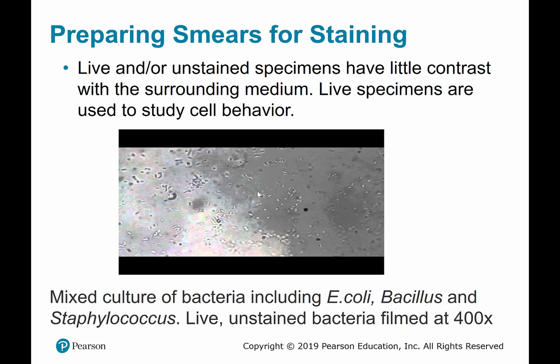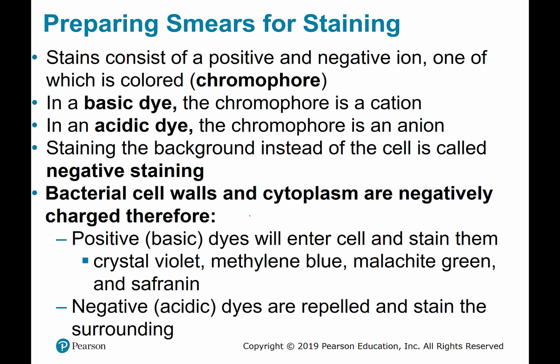However, you can see them here even in the image, although I'm not showing you the video, they're colorless. Okay, so it's hard to look at cell shape, but you can study behavior. And now just to start talking about the stains that are used to add contrast to the bacteria.